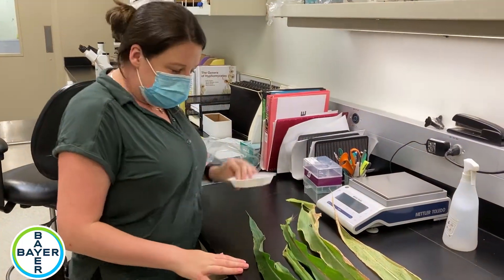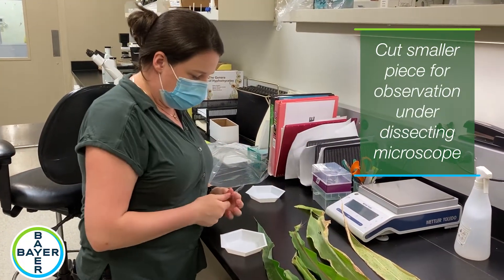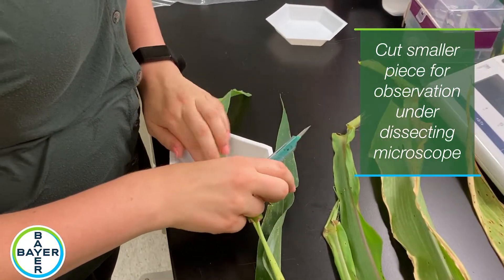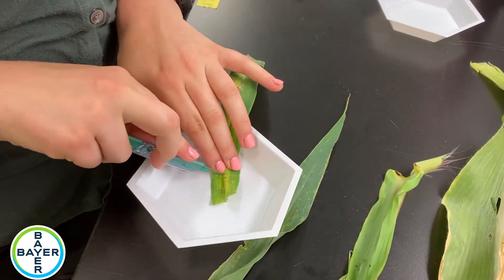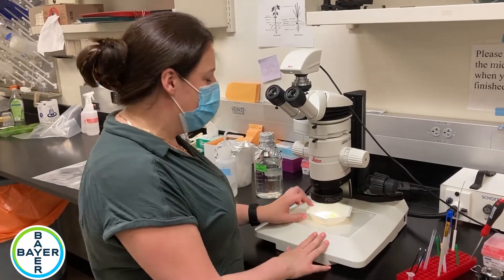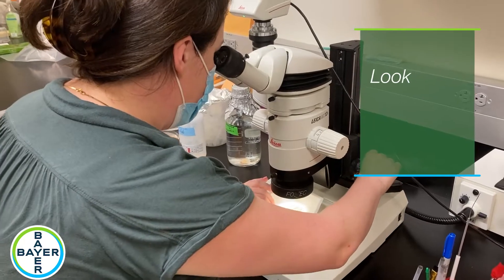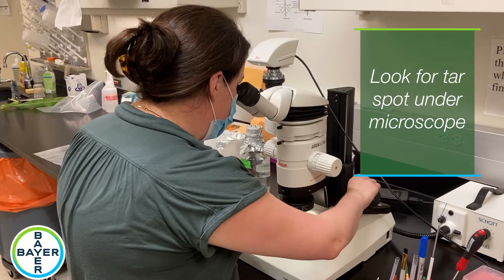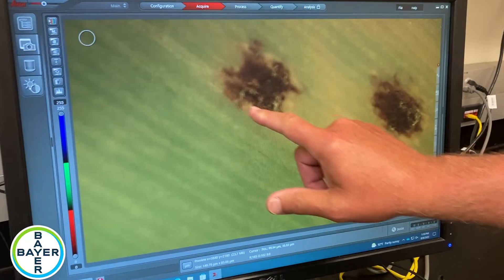Now I'm going to cut out some smaller pieces and take a look under the dissecting microscope. We'll take a look at the overview of the sample, and this is what Greg will have up on the screen — these lesions here.